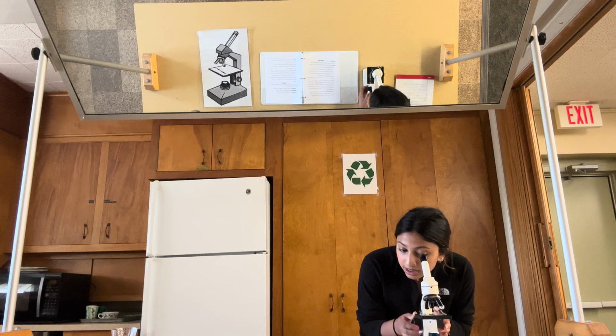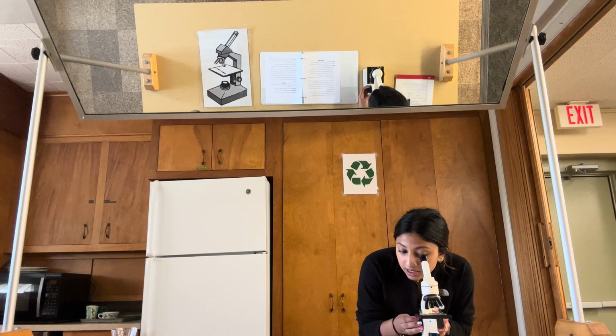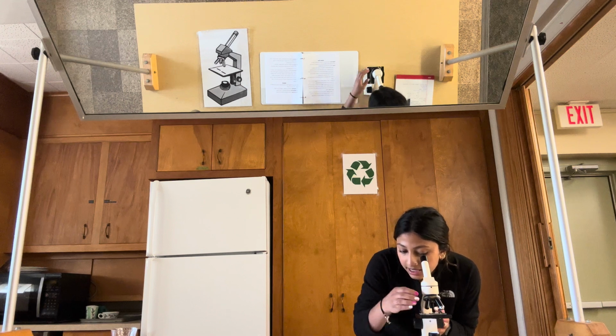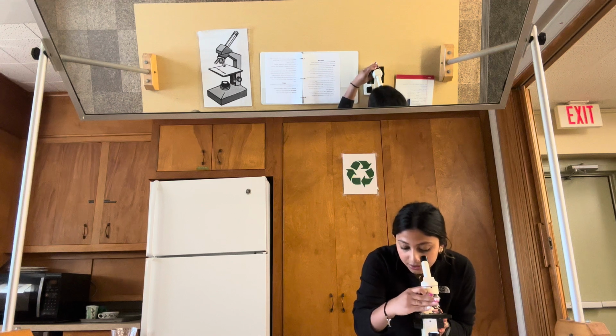For some samples like soil, the lowest magnification is the best. But for some samples like water, where bacteria is often viewed through the microscope, you may need to adjust it to a higher magnification. But play around with it and see how the different magnifications alter your perspective.